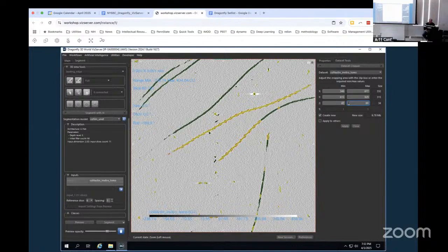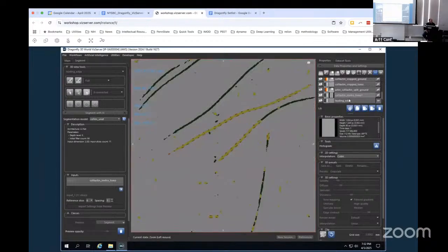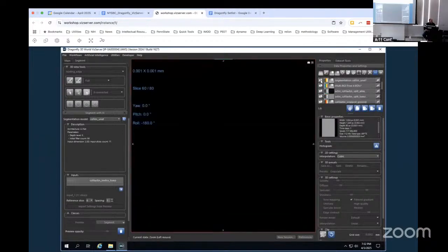We may be just out of luck. So you could apply the network to the already cropped version and hope that the ROI tool works. Oh, that's a good point. Let me do that. Let me try that.